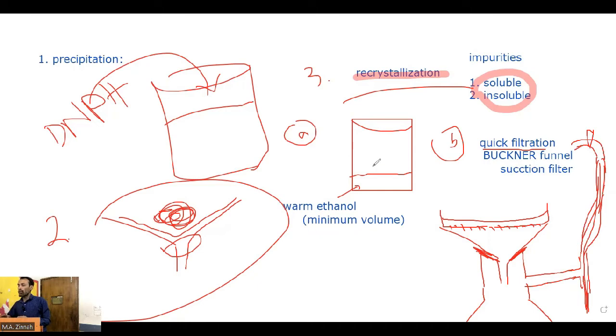And now for the liquid, for the mixture here, for quick filtration, this will filter very quickly. Of course there is another step: before you pour the solution here, you may warm, you may also heat the filter paper a little bit, or the funnel. This filter funnel has to be heated a little. How can we heat it?